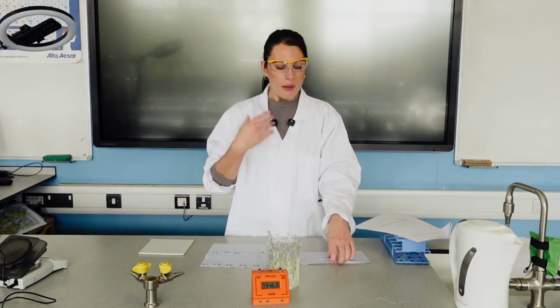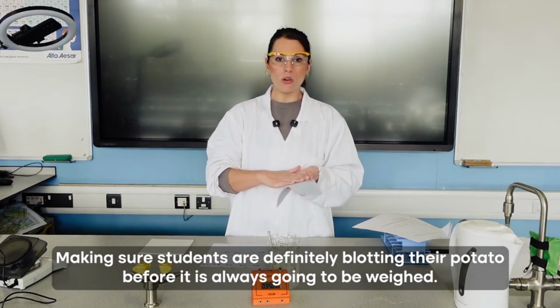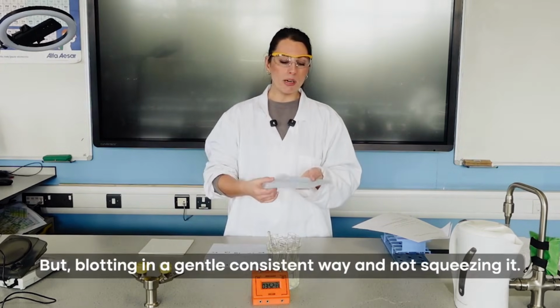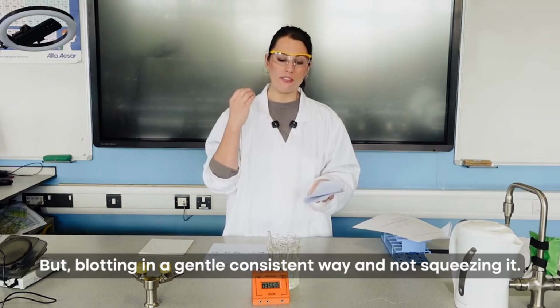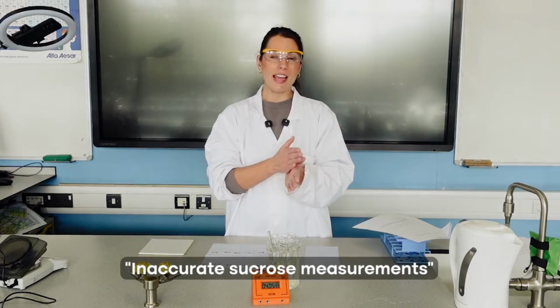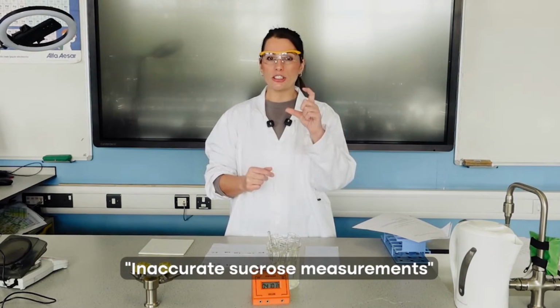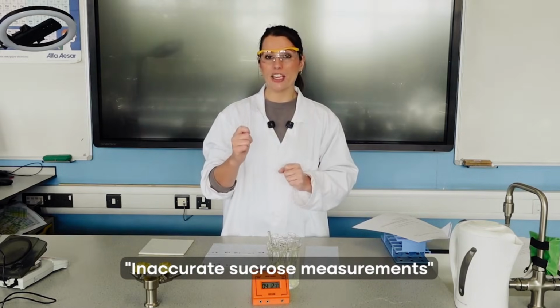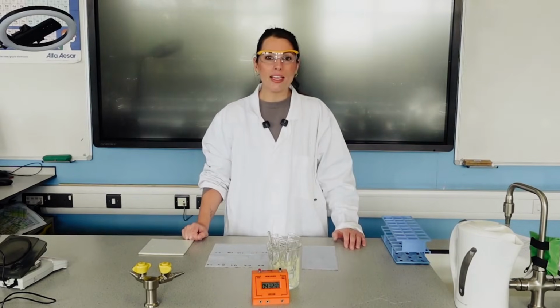That should really help. Making sure students are definitely blotting the potato before it is always going to be weighed, but blotting in a gentle, consistent way, not squeezing it, because that draws water out from the cells themselves and therefore affecting the mass. And also when it comes to creating your different concentrations of sucrose solutions, really check that students are using their syringe accurately, so they're definitely creating the concentration that they think. So that is it for the osmosis required practical.